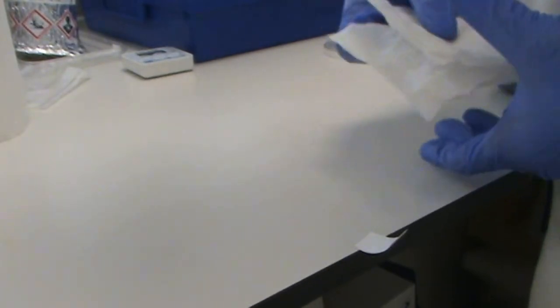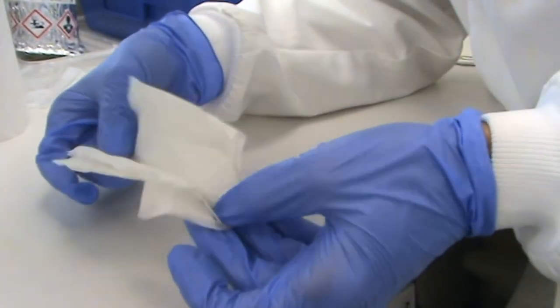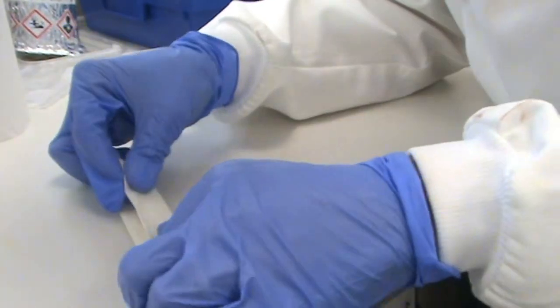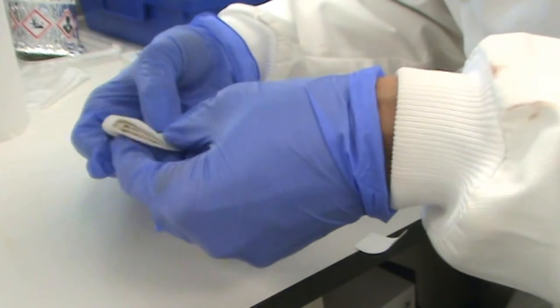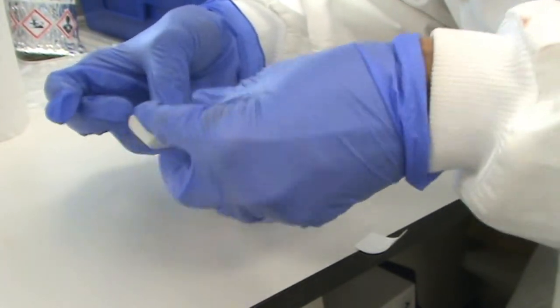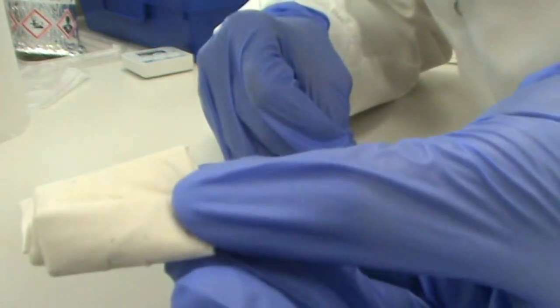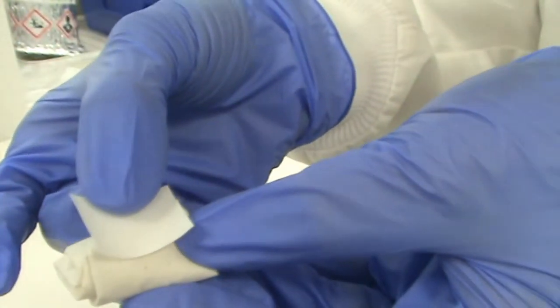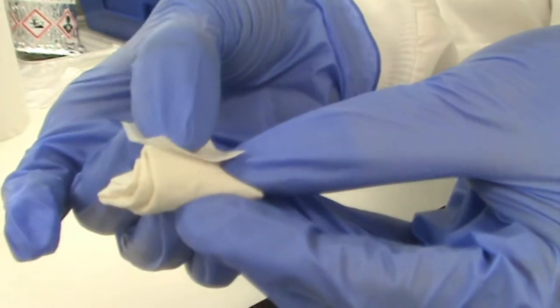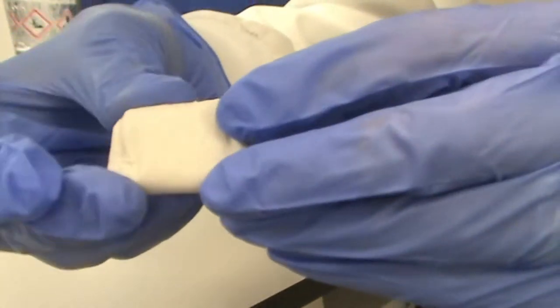While you're waiting for the grids to dry, take a piece of paper, it can be tissue paper, and fold it to make a bit of a cushion. Like this. Then place some tape on one side to secure it.